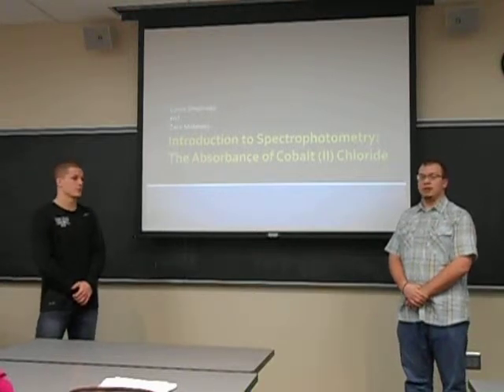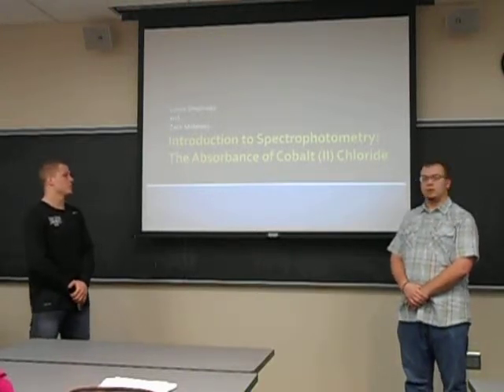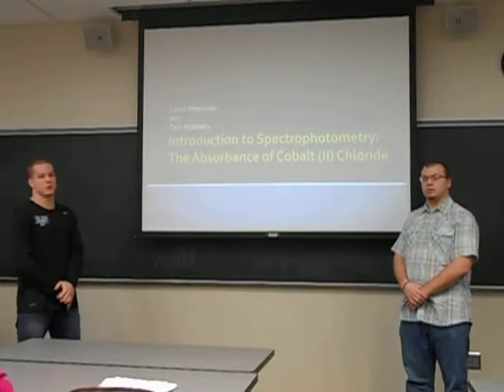Colby. And I'm Connor Smolinski. And this is an introduction to spectrophotometry of absorbance of cobalt-2 chloride.